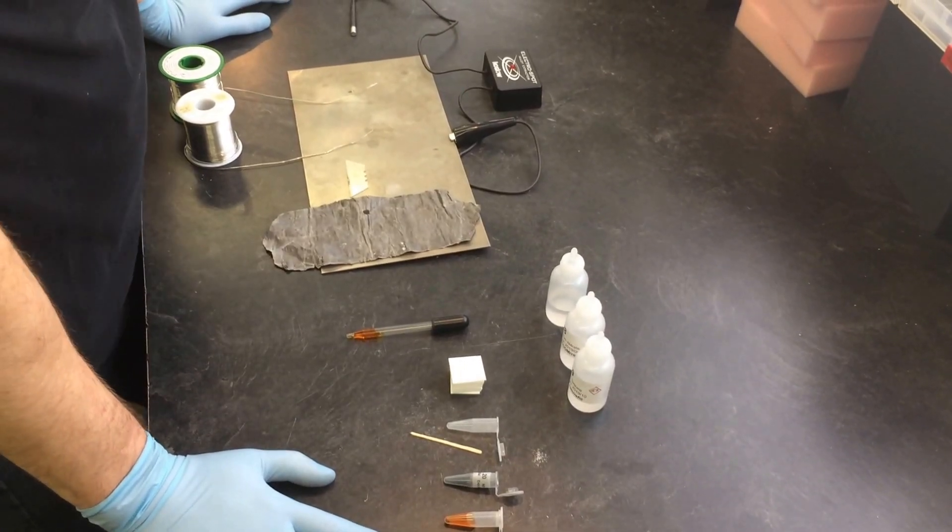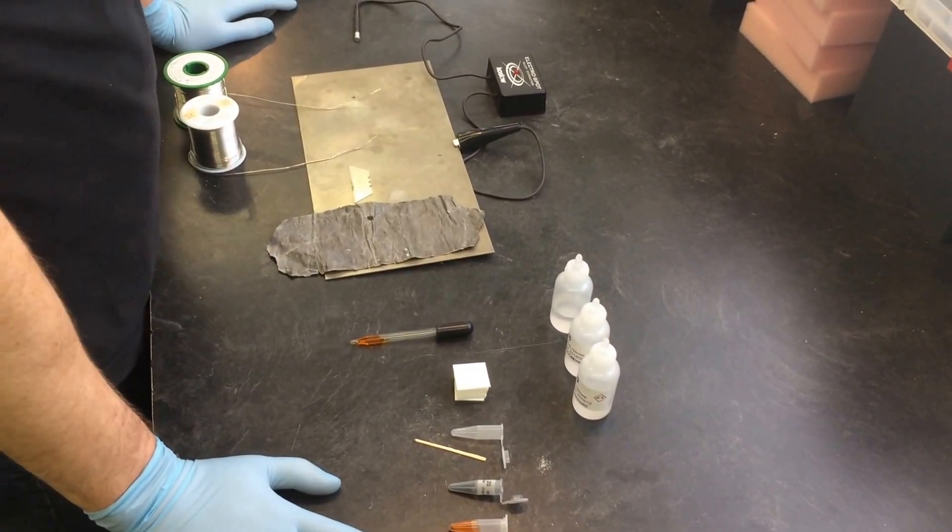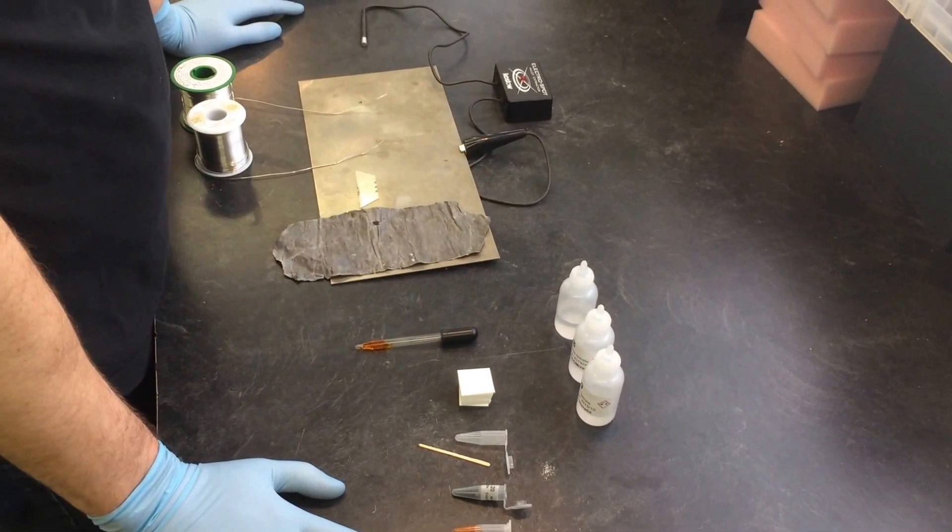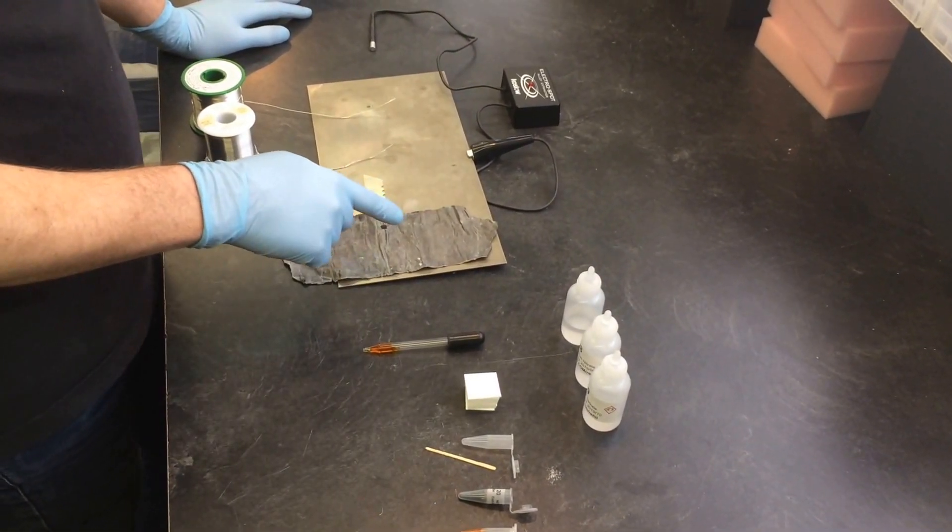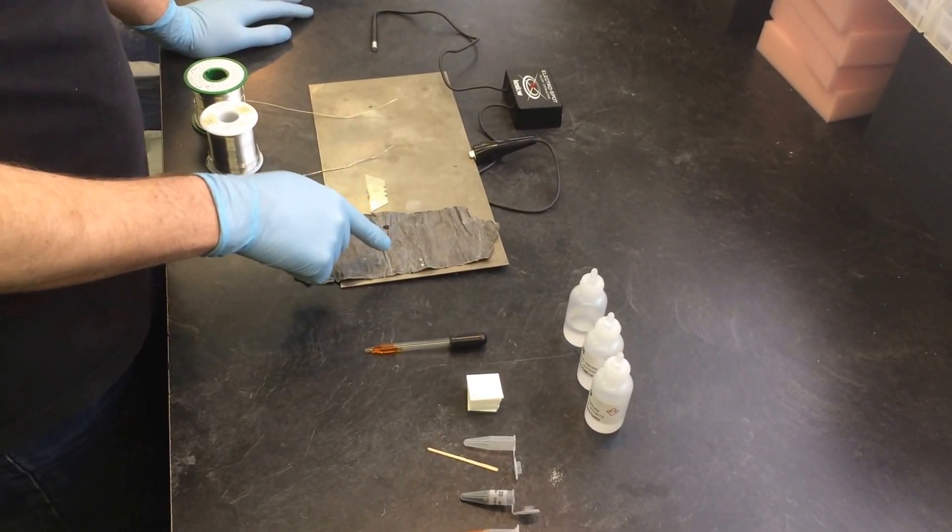Today I'm going to demonstrate the COSLO Lead in Solder Test Kit. What I have over here is a piece of lead, a lead sheet.